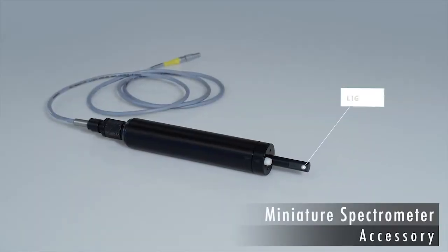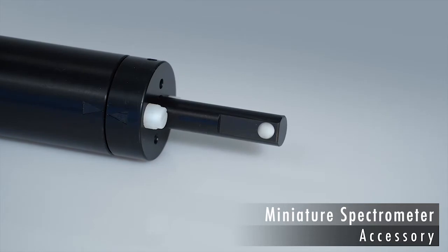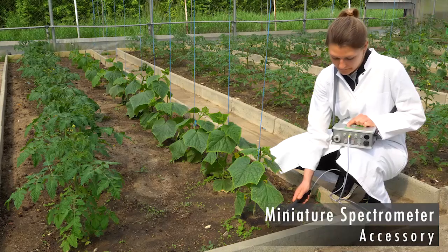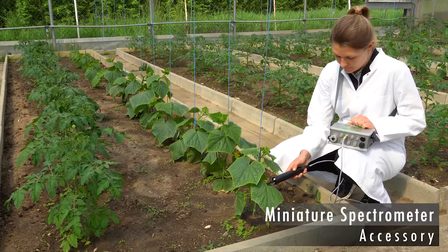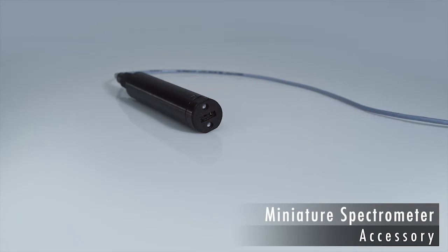The miniature spectrometer measures light spectra. The absence of moving parts makes the spectrometer ideal for outdoor studies. The spectrum includes the visible range which plants use for photosynthesis, and also covers the far-red range, which is important for developmental processes controlled by the phytochrome photoreceptors. The miniature spectrometer precisely examines gradients of intensity and spectral composition of light — both key factors for plant growth.